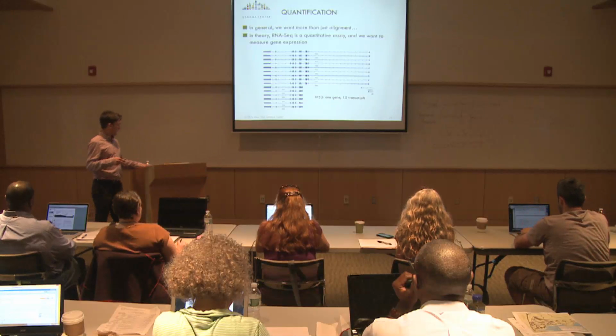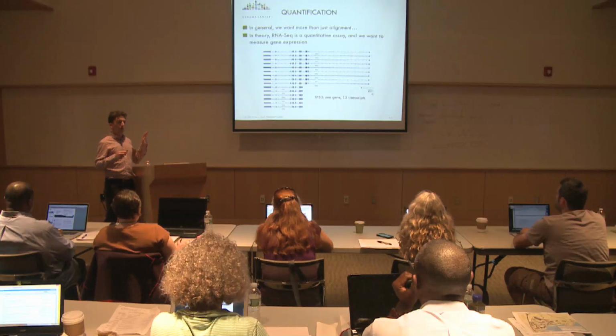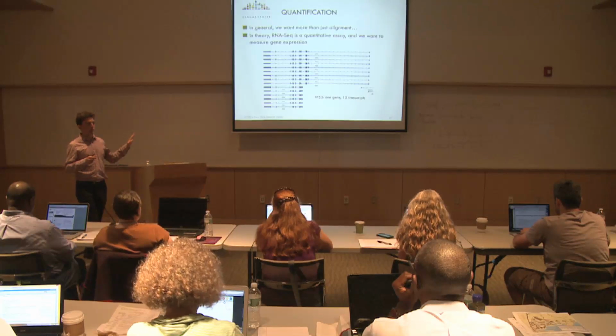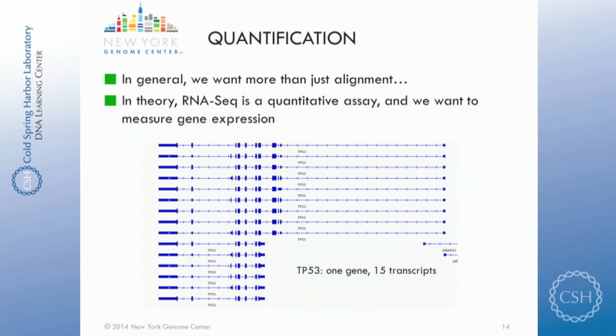So that was kind of the end of the part on the alignment. Now we have an alignment file that records all the locations of the reads, and after that we'll talk about the quality control we can do on this. What I want to describe here, and that will be expanded in a presentation by Molly Hamill next week, is the quantification. Usually you don't want to stop at the alignment. It's crucial to do the alignment, but you will do something else after, and what you want is a good estimate of the gene expression.